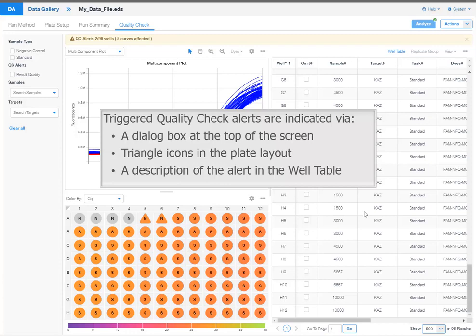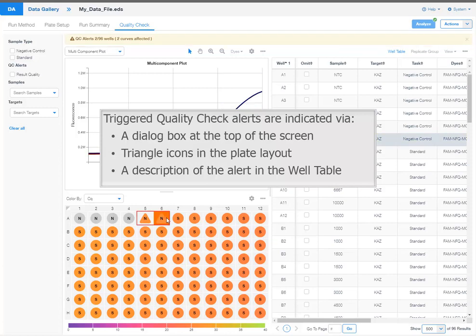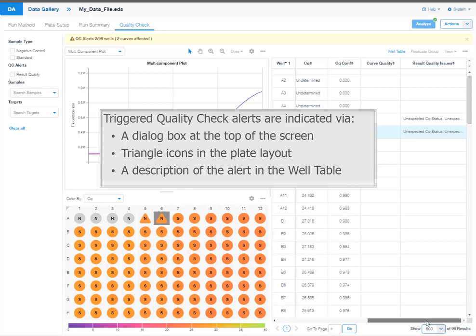Triggered quality check alerts are indicated via a dialog box at the top of the screen, triangle icons in the plate layout, and a description of the alert in the well table.